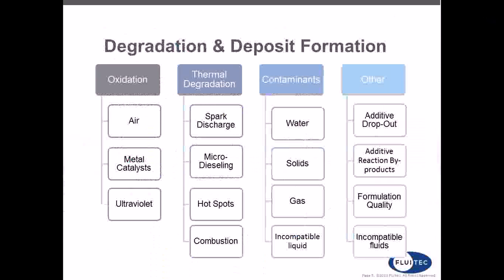Sometimes there are sight glasses that could be exposed to UV degradation, and it could rapidly accelerate degradation of a tiny bit of oil in a sight glass. But the one thing that a lot of people don't take into account is that when you're in the field drawing samples, before you take that sample and ship it off to the lab, make sure that it's not exposed to UV light, because UV light really can influence and in some cases really accelerate degradation and can influence the quality of the reports that you get back from the labs.